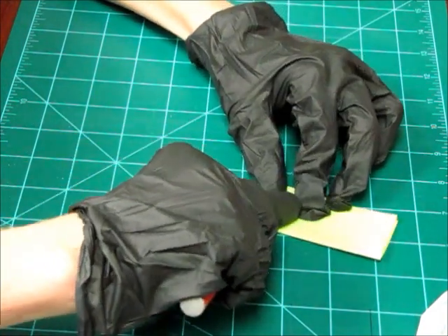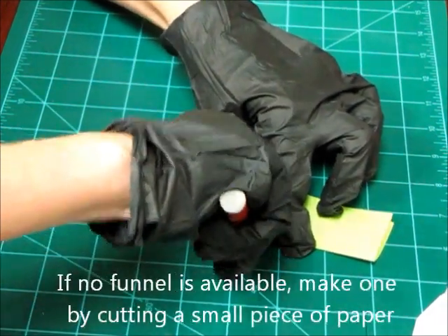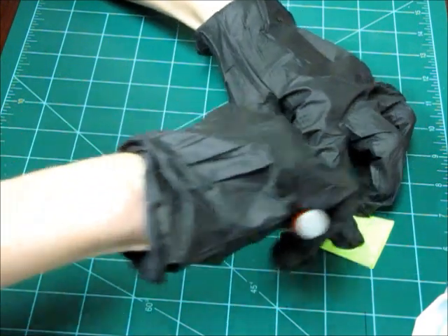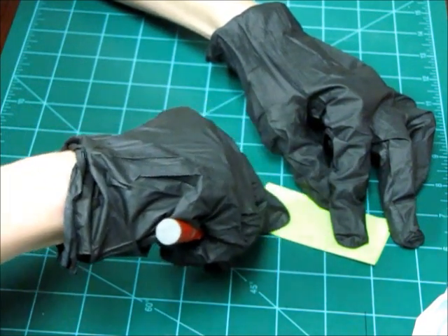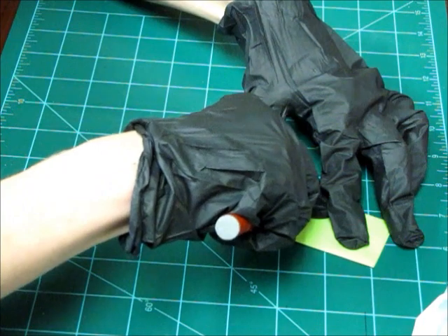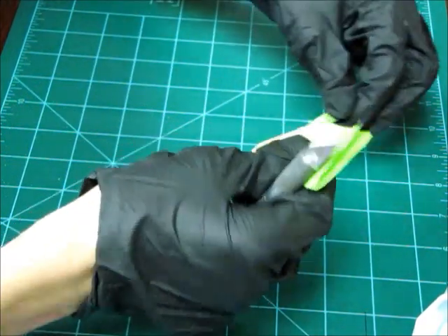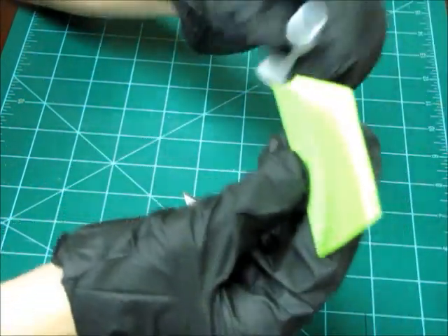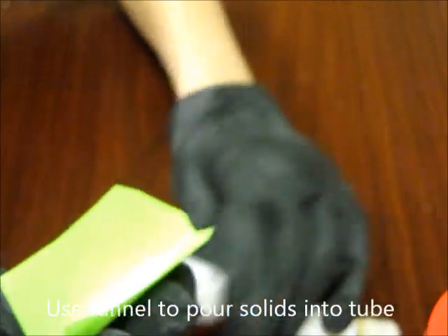The best method for inserting solids into the tube is a funnel. If no funnel is available, you can make one by cutting a small piece of paper as shown here. As you can see, a simple folded paper is the right size to fill our tube. You then use the funnel to pour the solids directly into the second chamber of the tube.